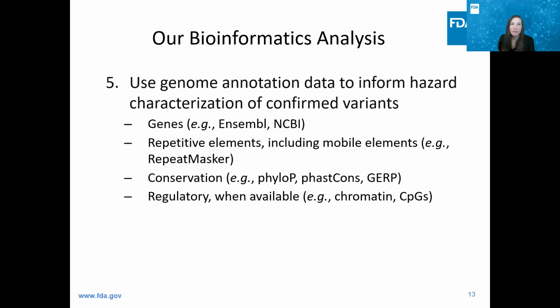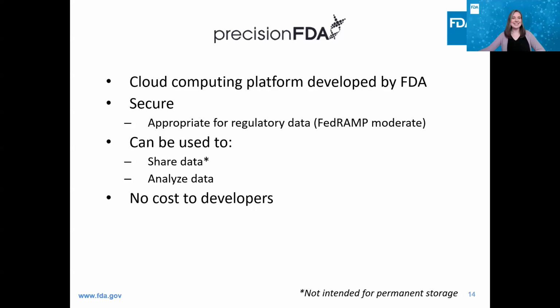I'll now hand it over to my colleague Ashley Cook to walk us through the process for electronically submitting NGS data using FDA's precisionFDA platform. Thanks, Alexis. Now I will share with you information about precisionFDA.